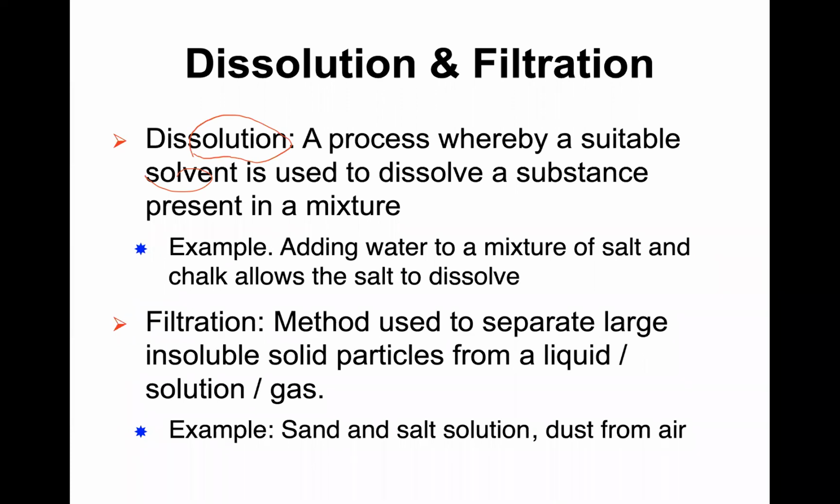For example, if you have a mixture containing salt, which we will typically take to be sodium chloride, we know sodium chloride is very soluble in water. For example, sodium chloride can go up to 32 grams per 100 milliliters of water. So that means if you have 100 milliliters of water, you can dissolve up to 32 grams of salt.